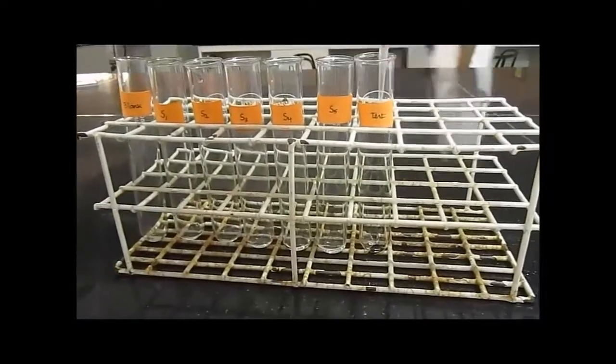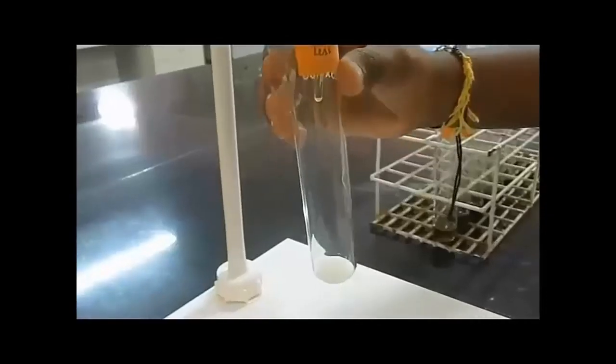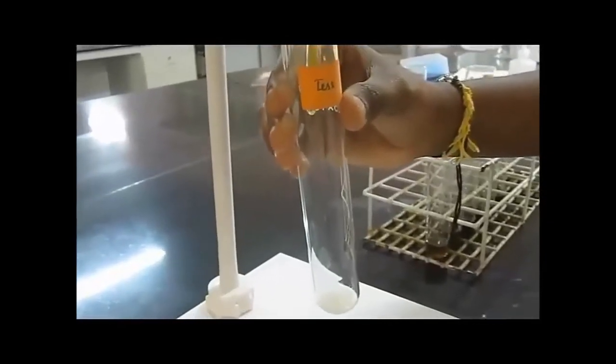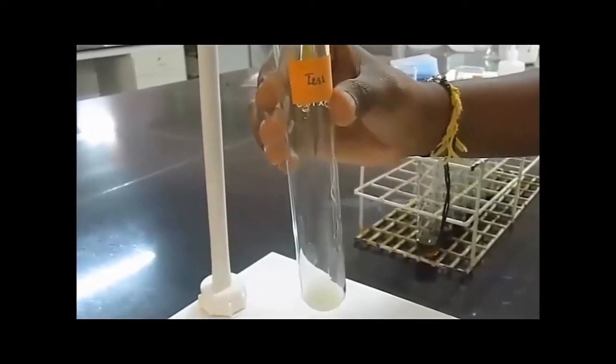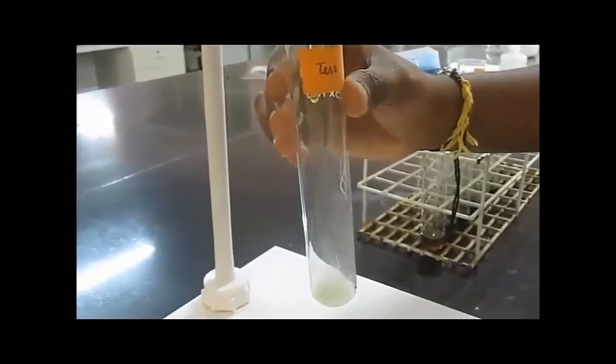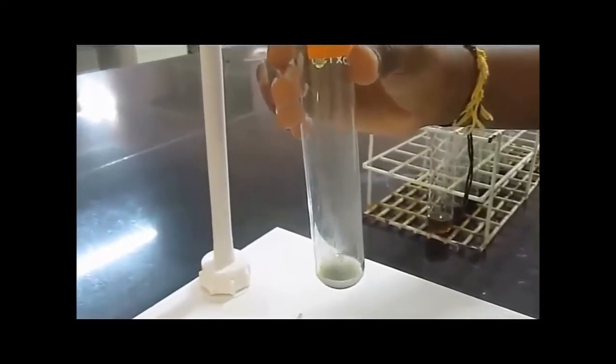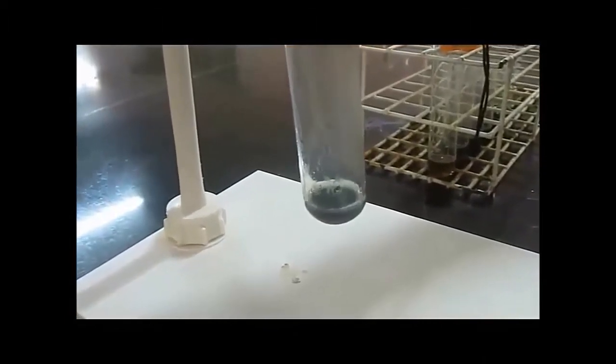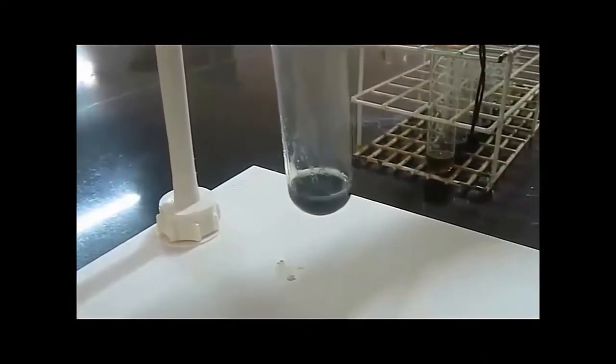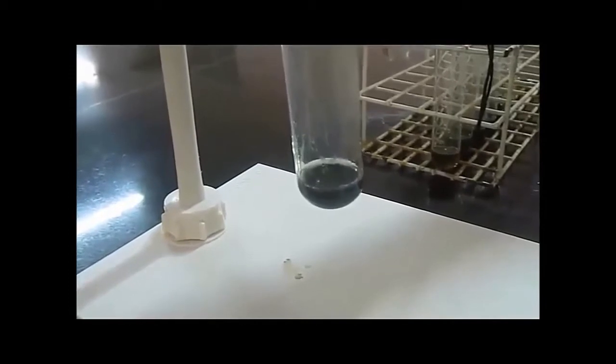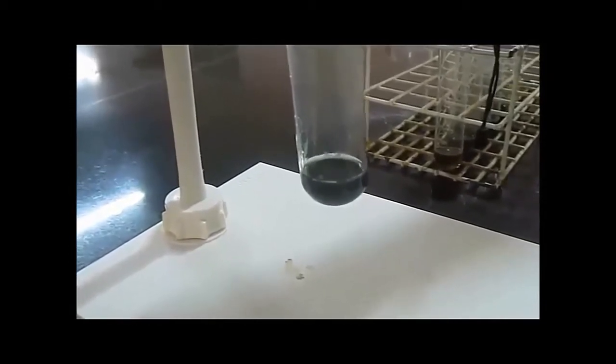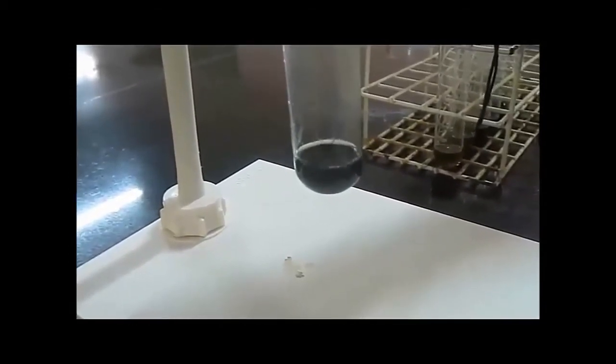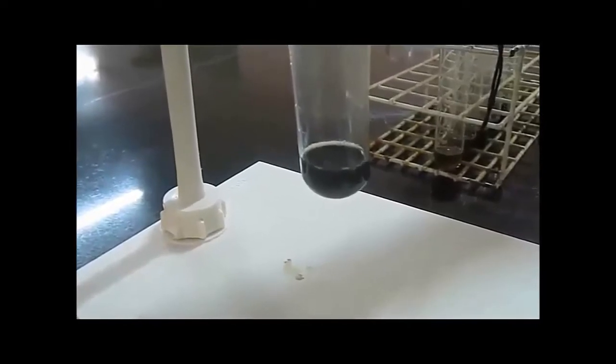The extract is pipetted and added to all the test tubes. Add 4 ml of antron reagent to all the test tubes. This antron reagent is prepared by dissolving 200 mg of antron in 100 ml of ice-cold sulfuric acid.